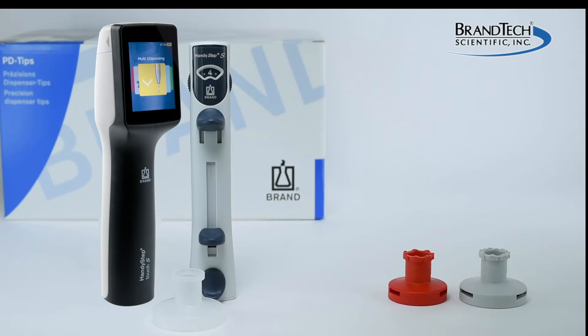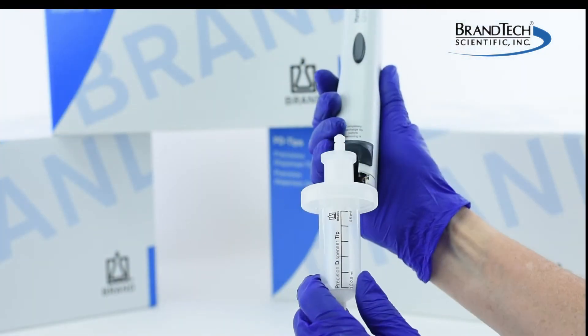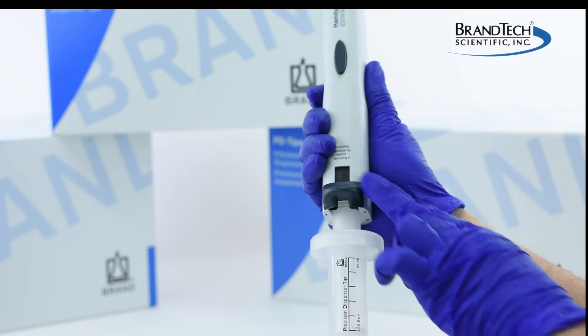Adapters are manufacturer specific, therefore it is necessary to use a brand adapter with a brand PD tip. Once the adapter is attached, the PD tip can be inserted into the instrument and is ready to be used.